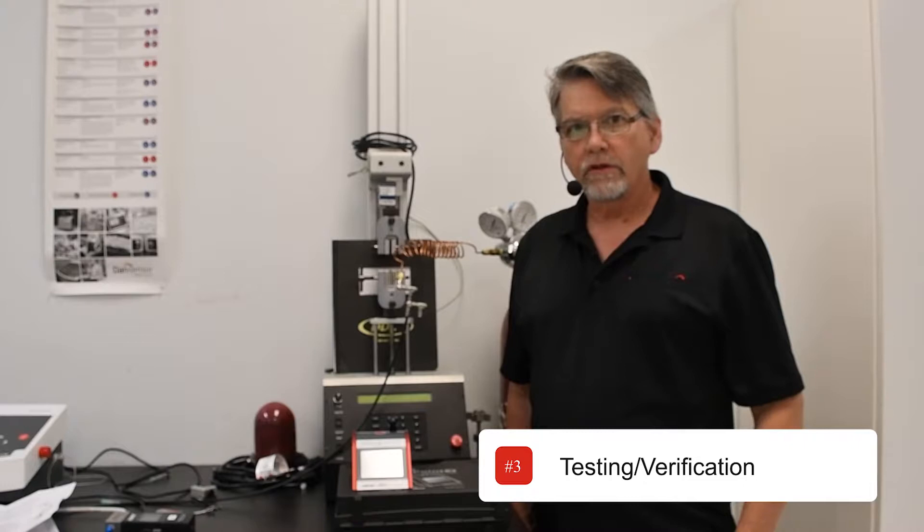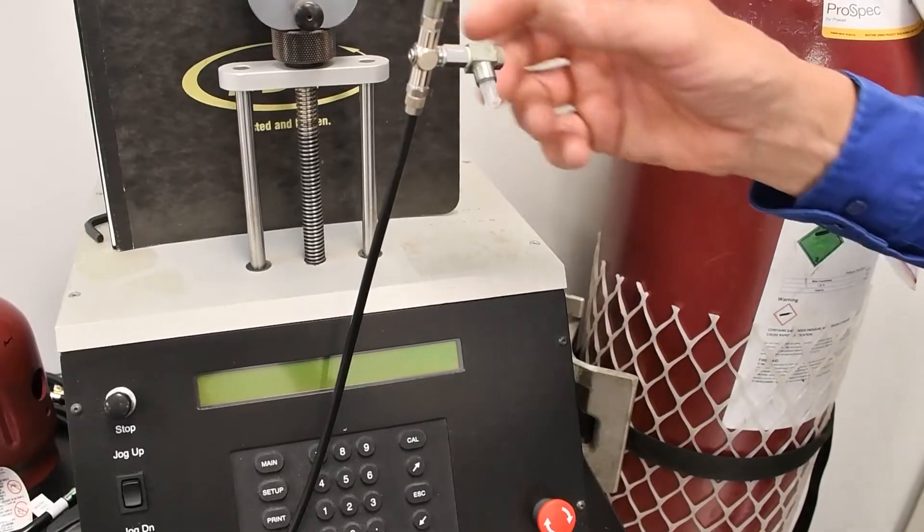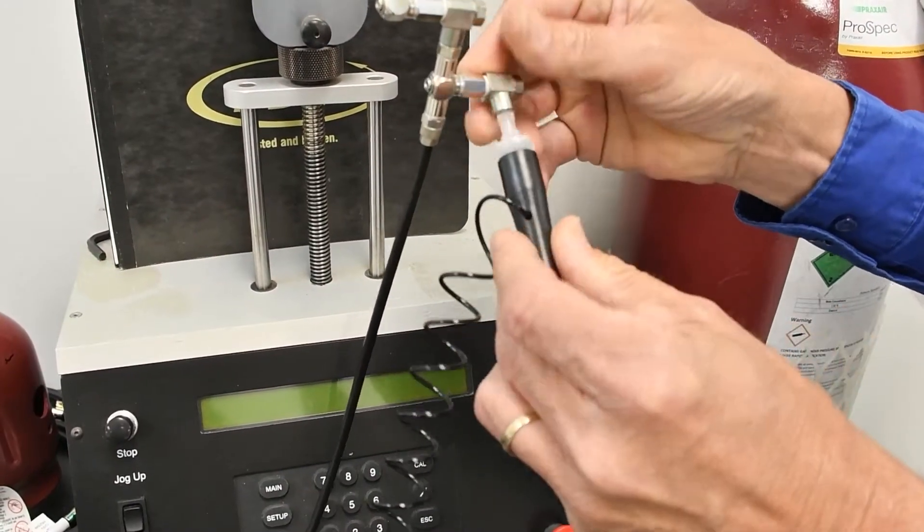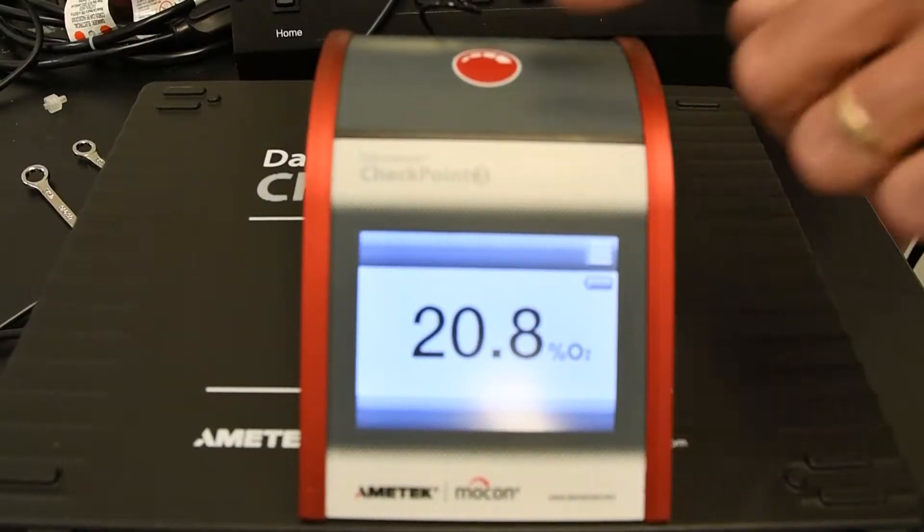Now I'll demonstrate the verification process for the Checkpoint 3. Connect the measurement hose from the instrument to the pressure relief kit. Take a measurement with your instrument.